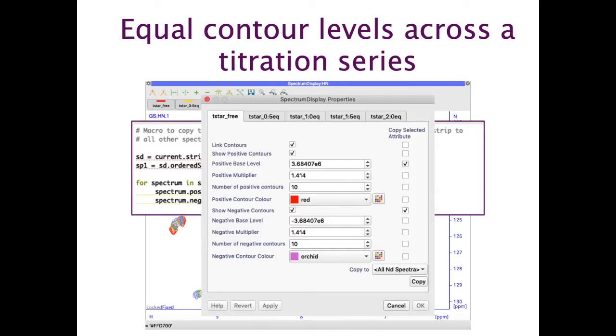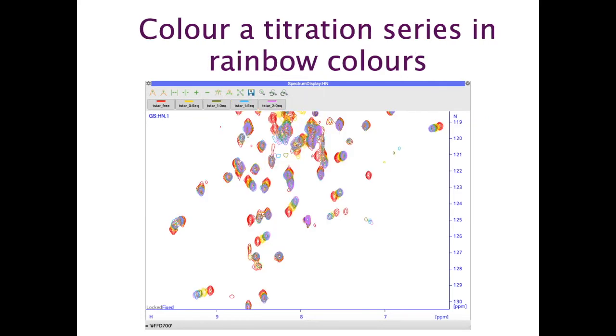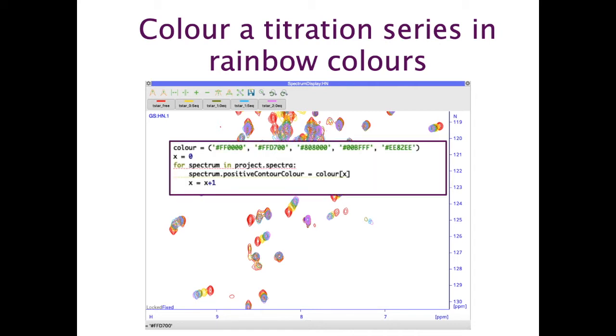In the meantime, actually you can do it relatively easily using the graphical user interface, the GUI, but back in November that wasn't yet the case. This figure in itself, I actually created using a macro. I was looking at a series of spectra and I thought, oh, it would be nice if I could just colour them all in easy colours in one go. And so I just wrote myself this macro and I can reuse that easily each time I'm looking at a series of spectra.